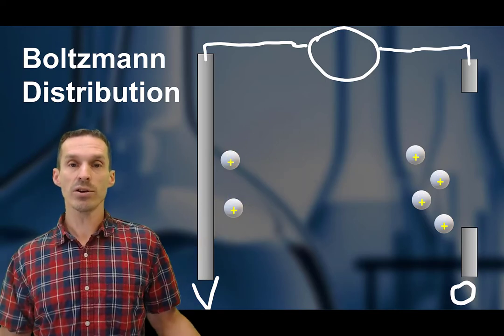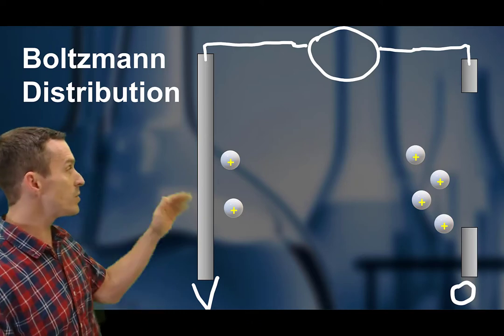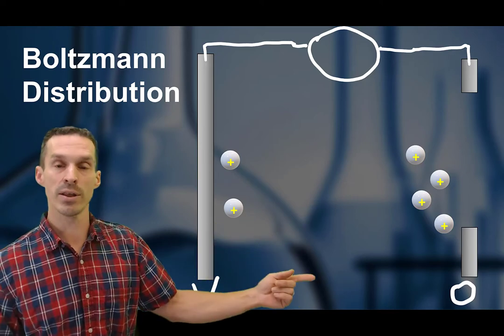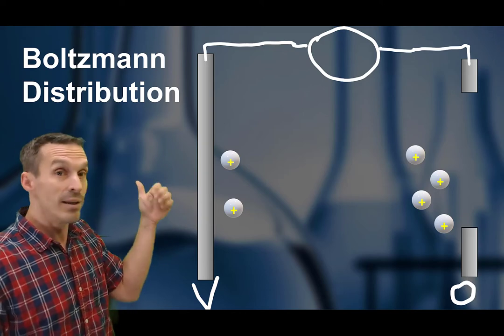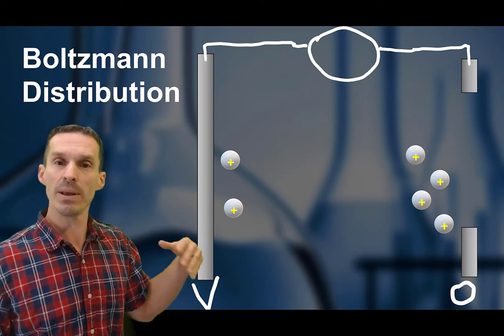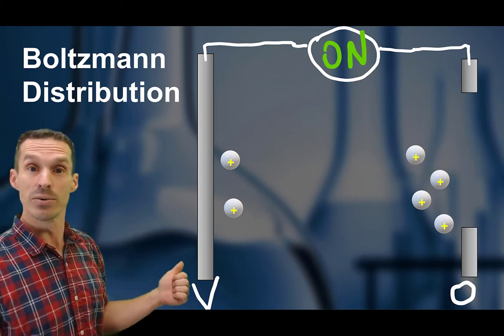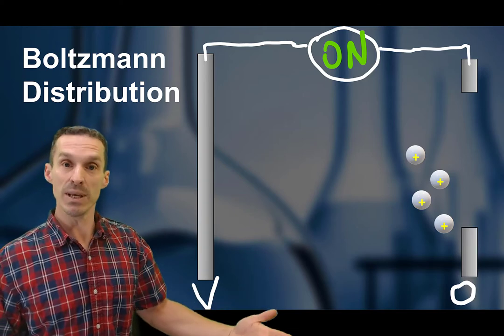When we're talking about turning on the voltage, what we're doing is supplying that kinetic energy. The ions will accelerate through the entire source region from one side to the other. For the ions that are at the back end, they will feel the entire electric field. They will be accelerated the most. So the ions on the back end, as soon as we turn things on, are going to accelerate and fly out with the full speed that they can.